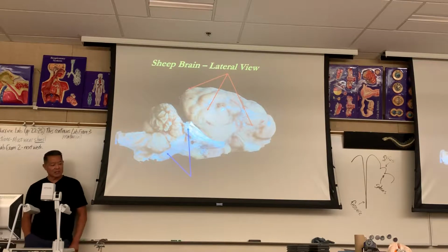The arachnoid is completely delicate, and it's stuck on the inside of the dura mater, and as soon as the butcher houses tear out the brain, pretty much it falls apart. It's so delicate. So I will not be pinning any arachnoid. Cool.